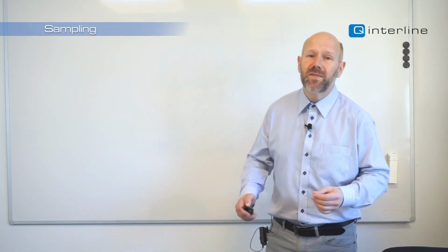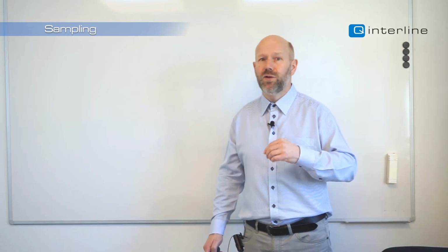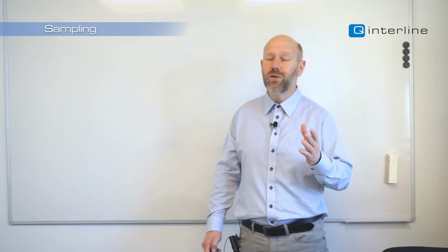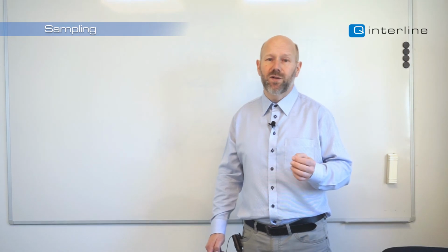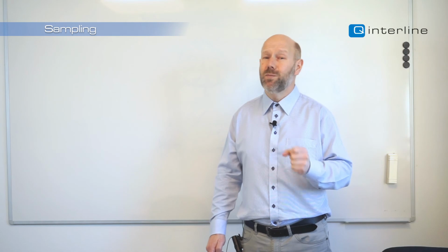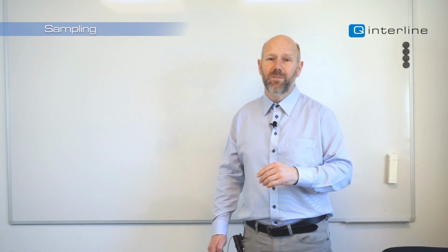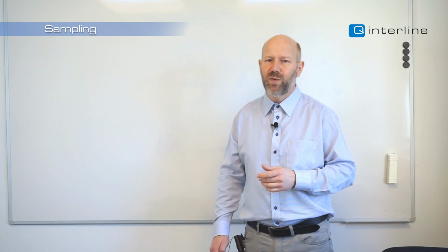So in summary, scanning and taking spectra is all about making sure you see the relevant spectral region. Make sure your resolution is good, not too good. Don't get greedy. Make sure that the spectrum has a very good signal to noise, relevant for your application. And remember that with high quality data, spectral-wise, sampling-wise, reference data-wise, reference analytical-wise, it's simply easier to build models.